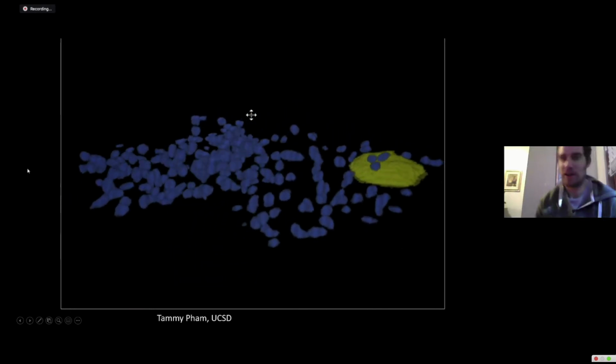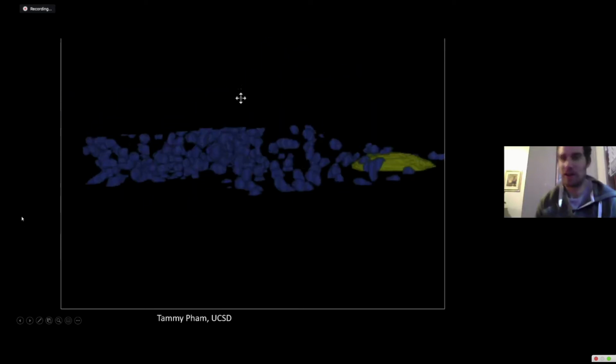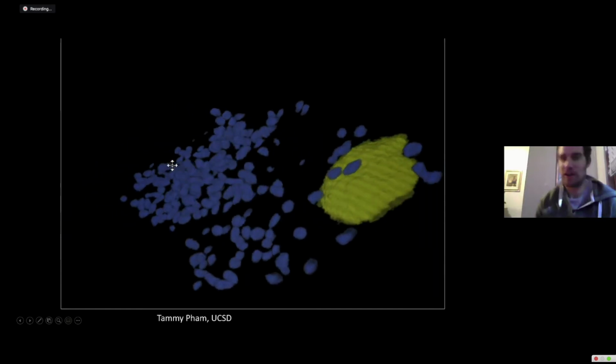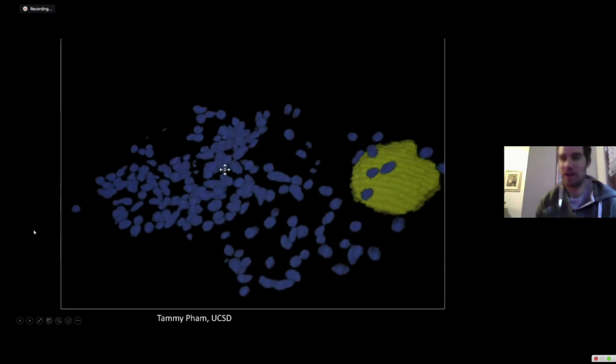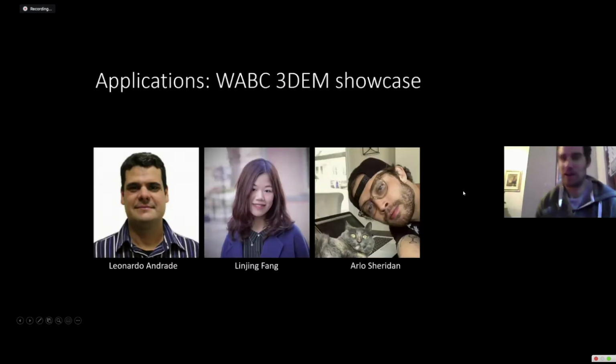And she's leading the analysis side of this project in terms of trying to figure out how mitochondria are distributed differently before and after noise. So this is how we can start to study that. You can imagine you can just take a distance from the center of each mitochondrion to the center of the nucleus, and you can look at the different distributions of distances based on before and after noise and start to understand if that's really a salient response to that injury.